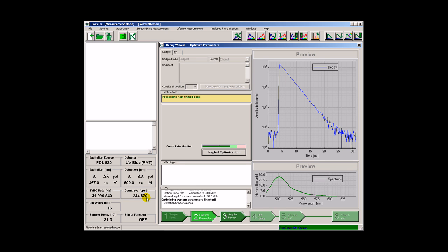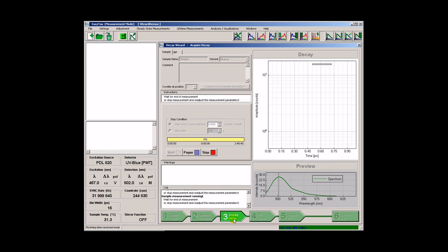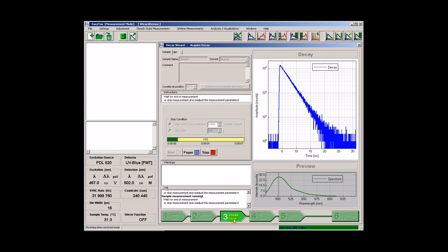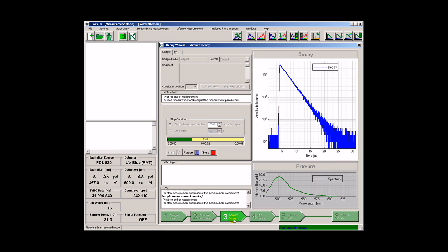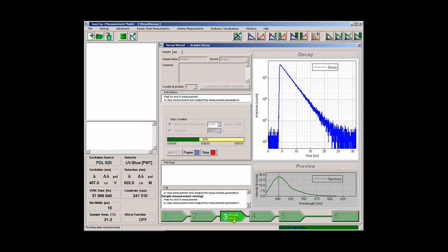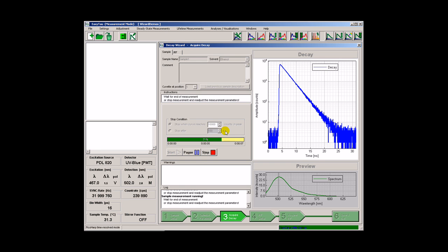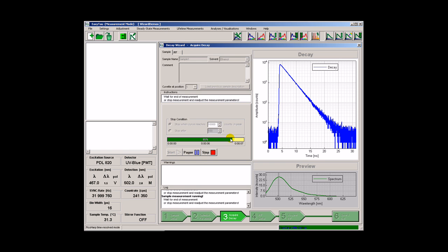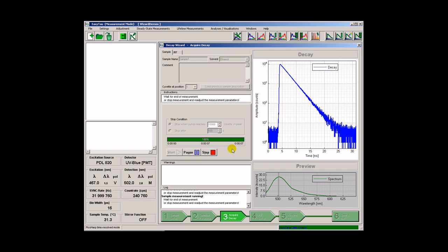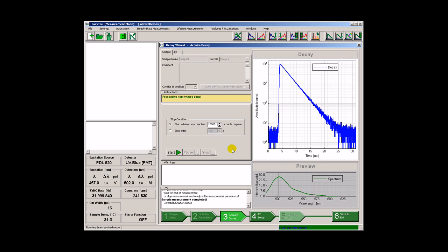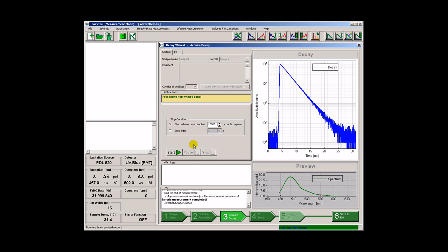We can now move forward and acquire a final decay curve. The wizard automatically acquired a histogram according to the default stop condition. In this case, it is 10,000 counts in the peak. If necessary, the histogram can be remeasured with a different stop condition.